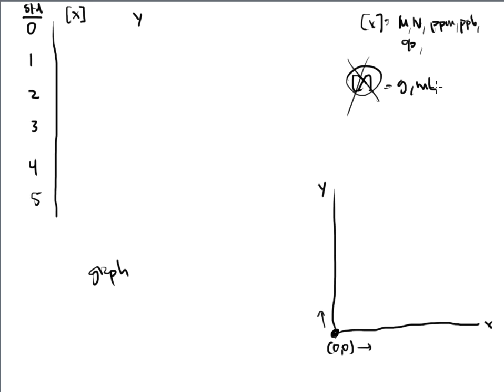Okay? I'll go ahead and say that in the world of analytical chemistry and an analytical laboratory, part per million and part per billion are going to be the most common, with ppm overriding ppb most of the time. So very often ppm is going to be on the x-axis. Again, normalities and molarities and percentages, they're all really super strong.